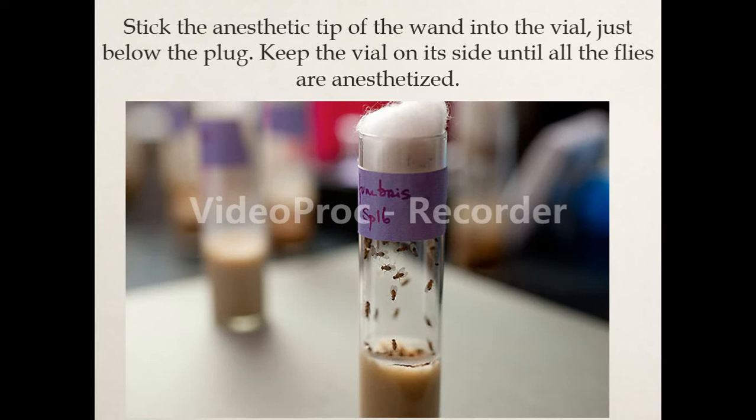So I just need to anesthetize the fly. A slight amount of the chemical is inserted into the vessel that contains the culture of the Drosophila fruit fly, which contains 5 grams of yeast plus water in equal volume. So when you do this, you notice that our flies are anesthetized. Understand? Our flies are anesthetized.